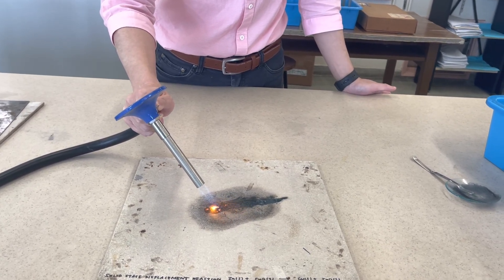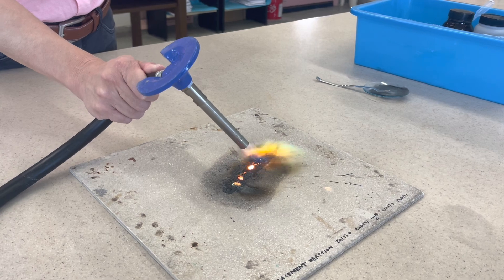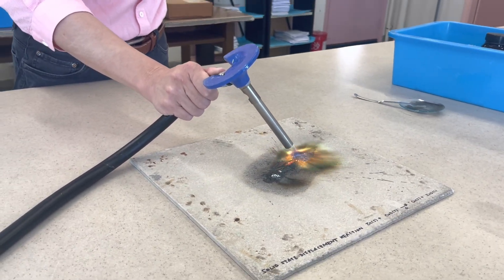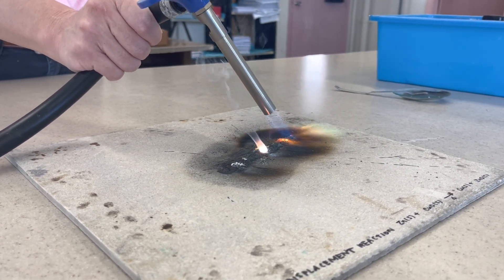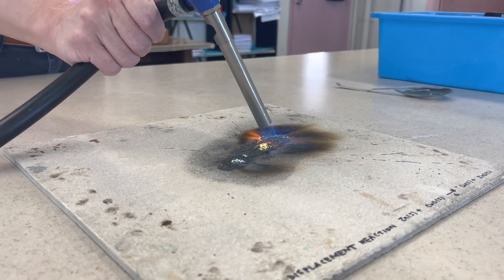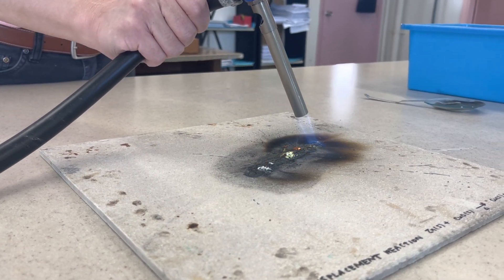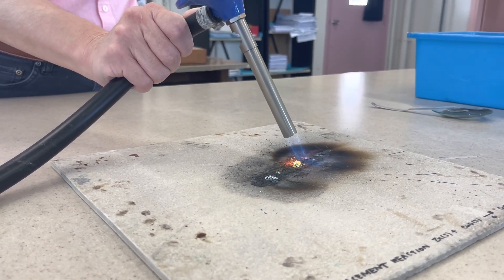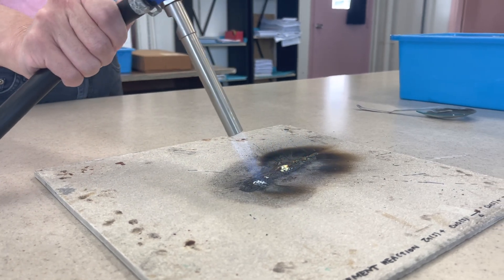Make your scientific observations: observe the flame color and the changes occurring. Now, what is the flame color you can observe? At the same time, observe what is happening to the mixture. Can you see there is some color change already?